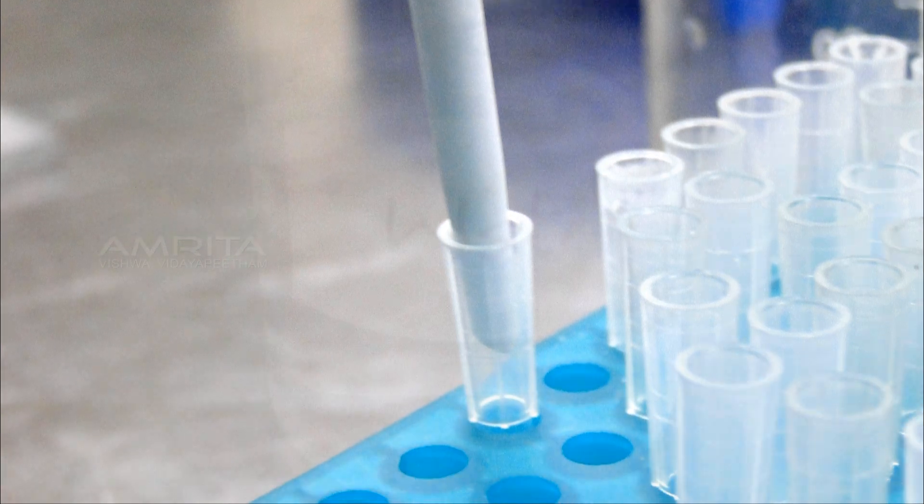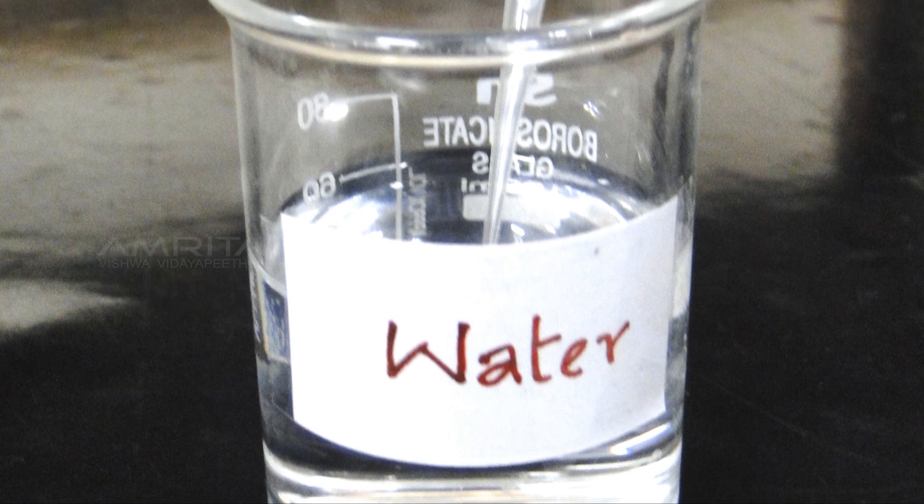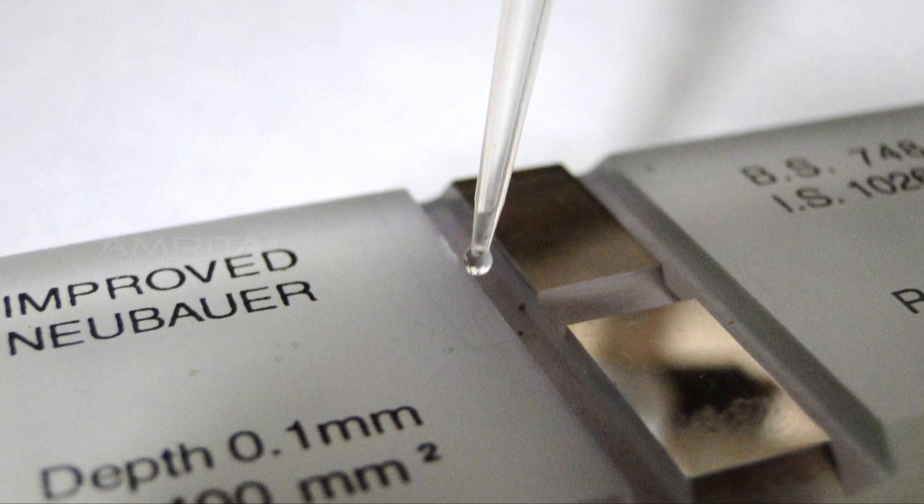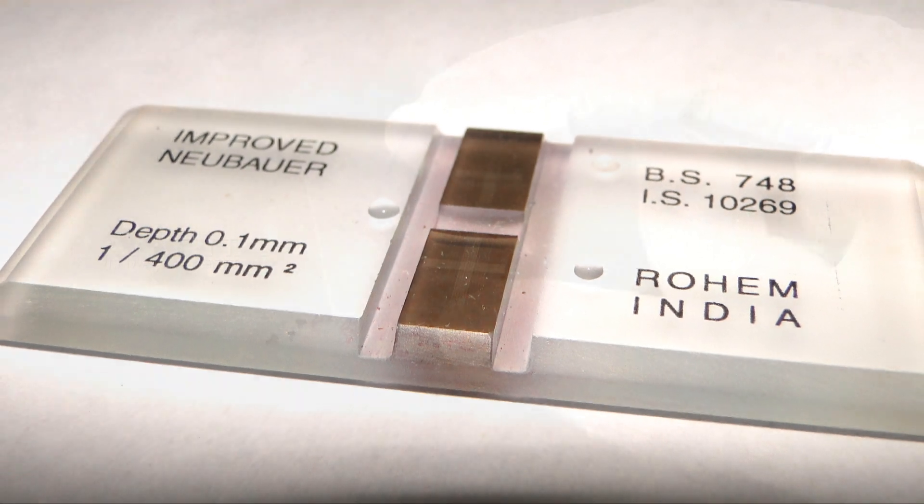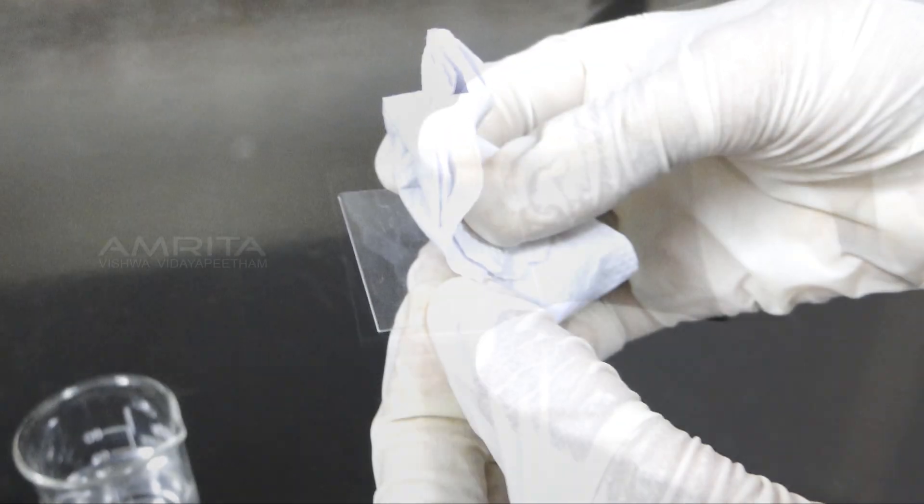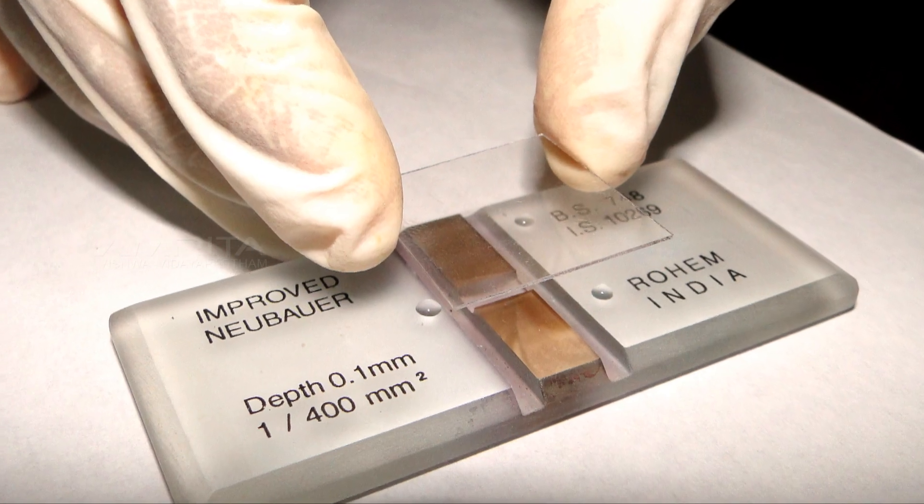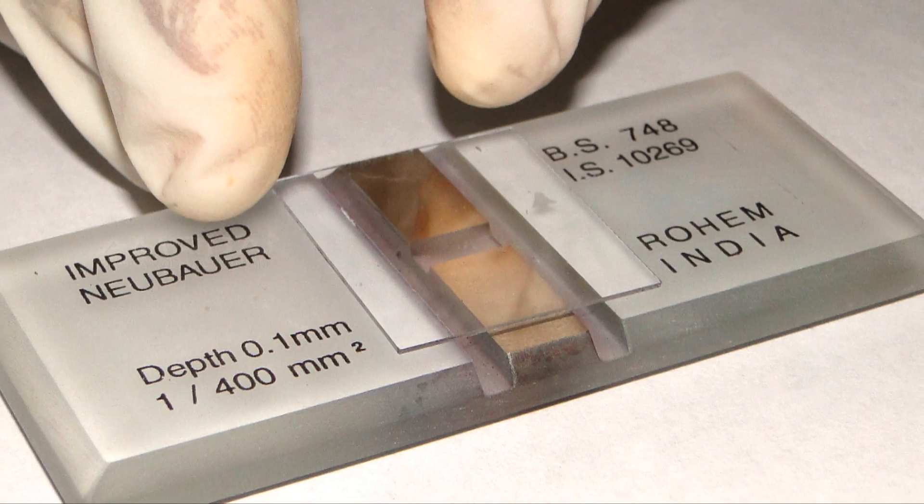Steps followed to prevent the slippage of cover slip: Dip the micro pipette in water and take a small quantity of water. Place a few drops on the surface of the hemocytometer. Take the cover slip, clean it with tissue paper, and place the cover slip on the hemocytometer. Make sure that it does not slide off.